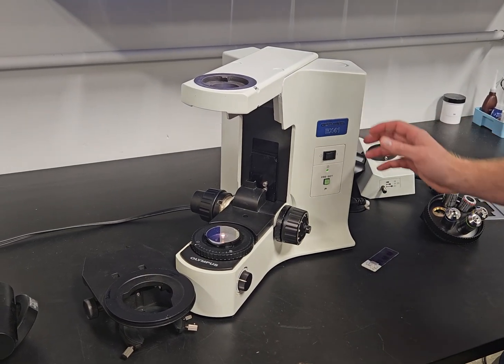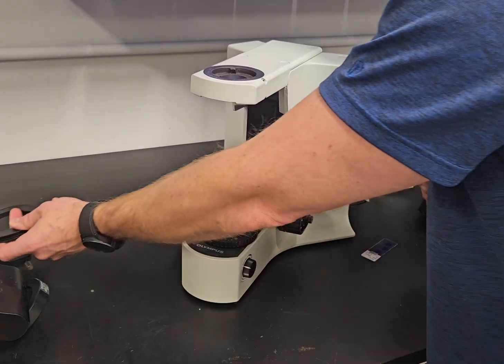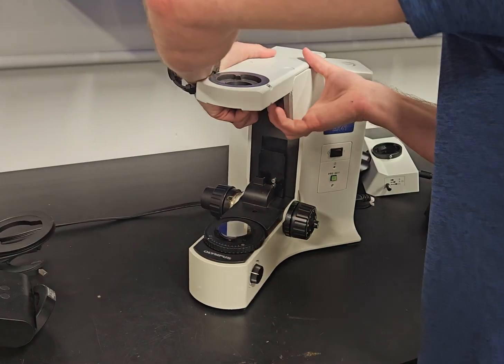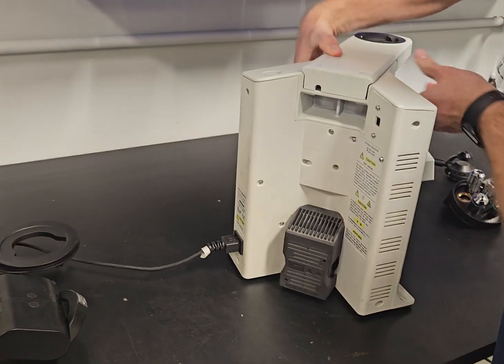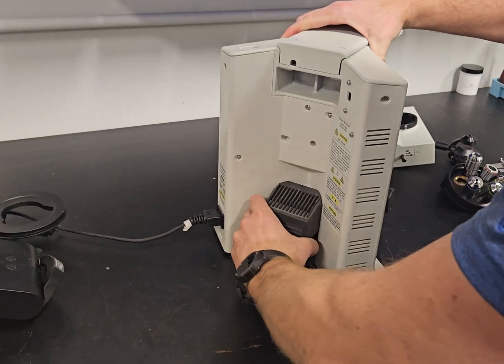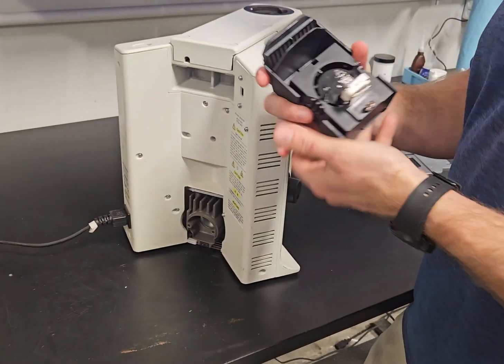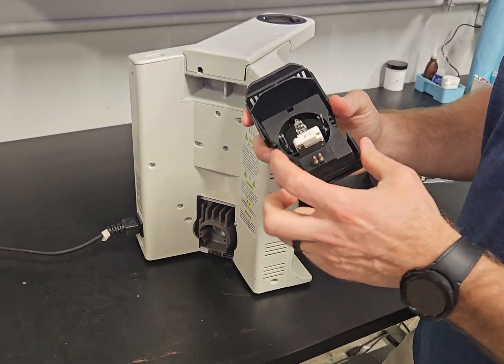So that's basically it. Wait one minute here. There is another thing we need to talk about, the lamp house. The lamp house on this scope, we talk about changing the bulb in some other videos. This lamp house is a six volt, 30 watt bulb.